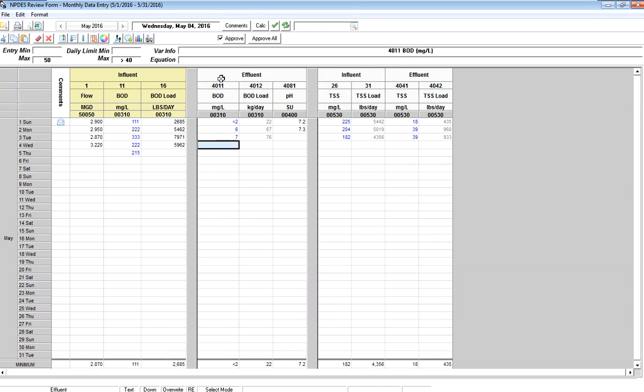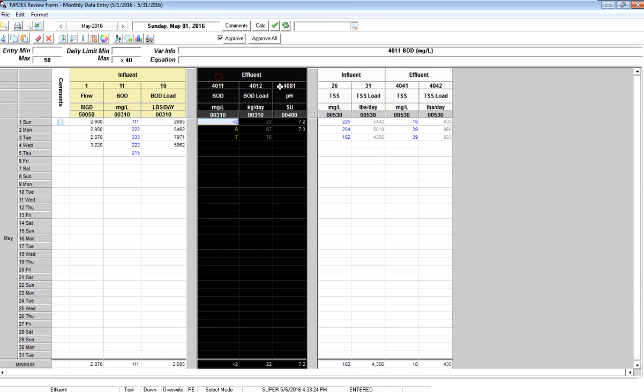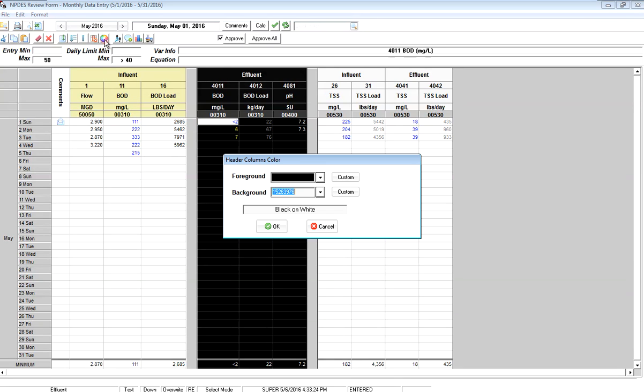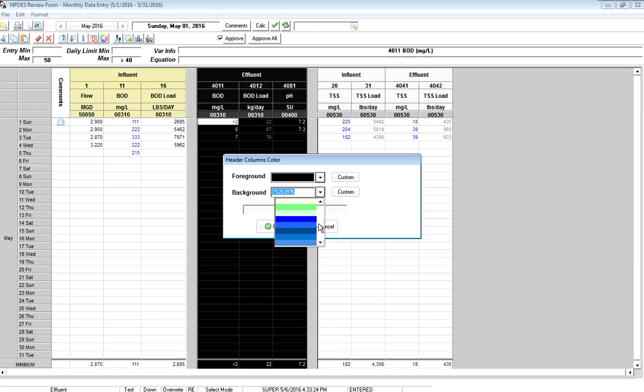And here I can highlight these three, use the shortcut button instead of right-click to set the header colors, and my Effluent should be a nice clear blue.